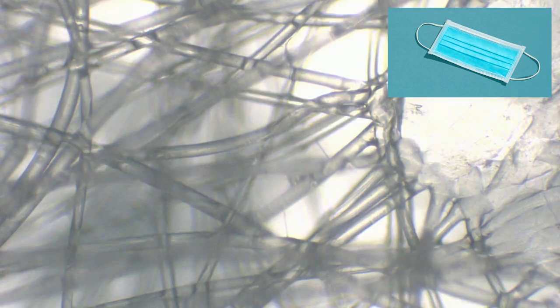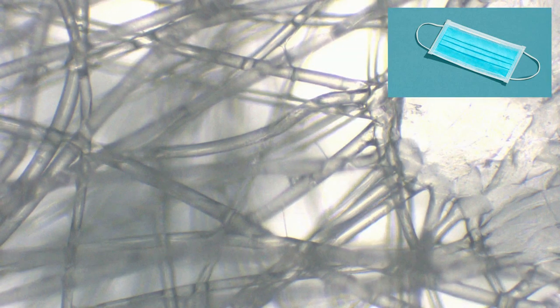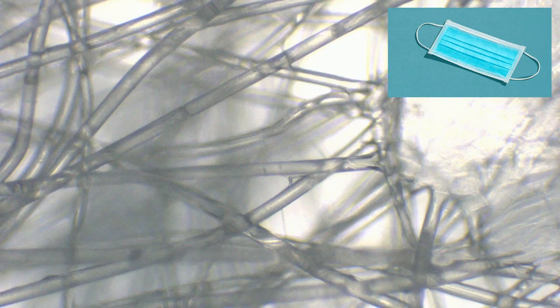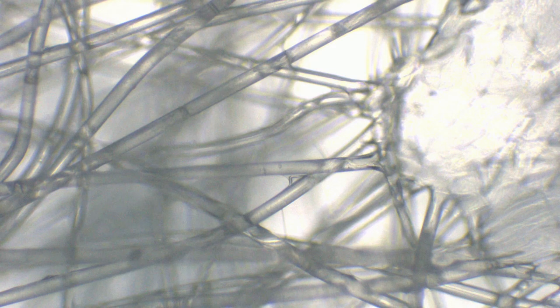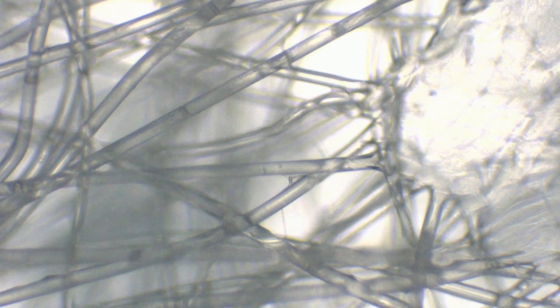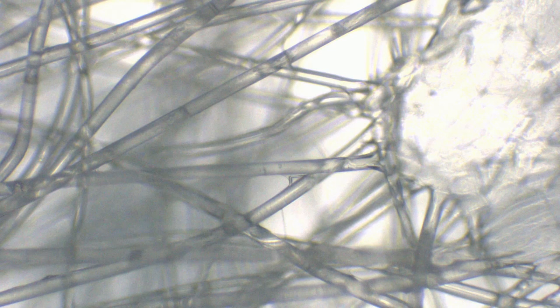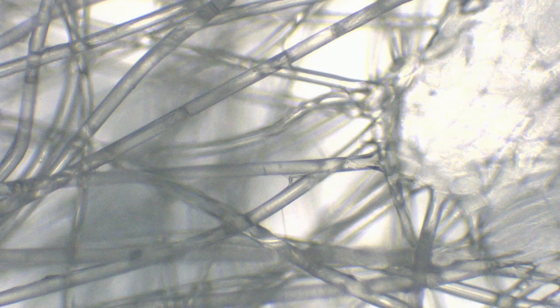The fibers make a mesh network. The particle size that can be stopped is around 5 micron to 10 micron. You can see the varied dimensions of the network. At some places it is wide and closer, at some places it is wide open.